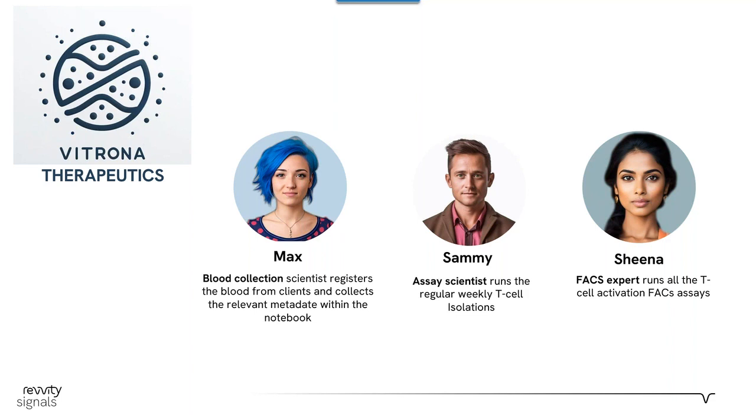And I think the important thing to talk about, which kind of gets back to the poll, is they work together to accomplish from patient blood sample all the way to looking at T cell activation profiles. Each of these groups works together to screen the candidate drugs for testing. And we need to keep this in mind because it is kind of a challenge to work seamlessly together when using these tools that are either disconnected or not easily searchable.